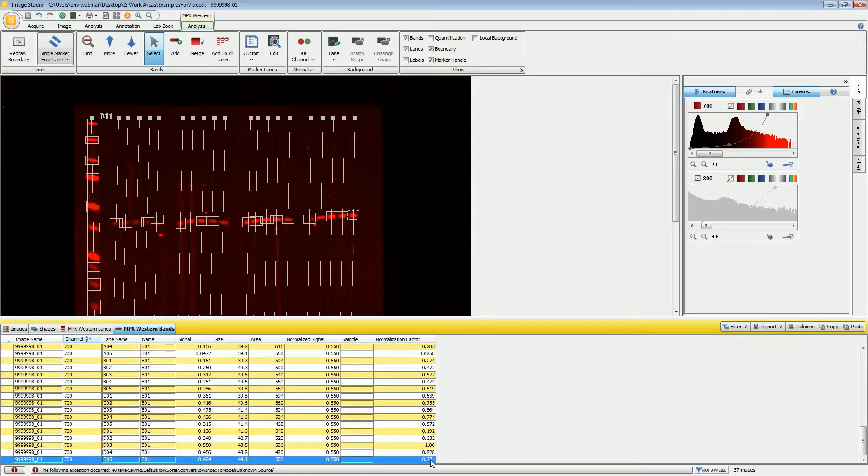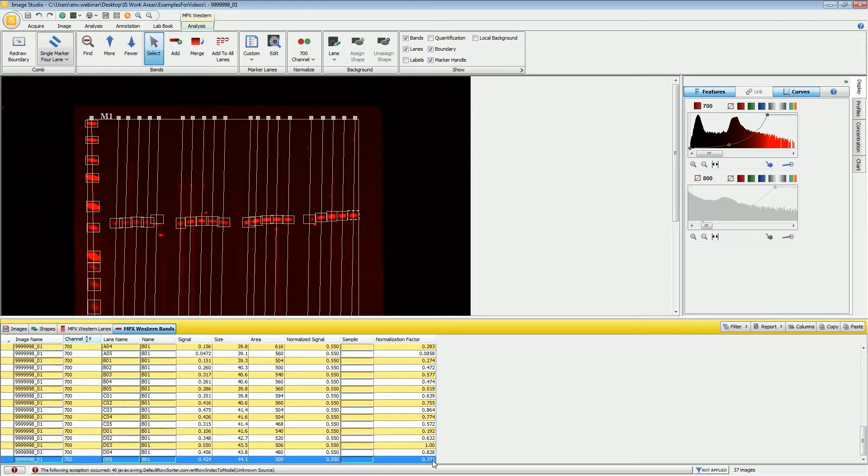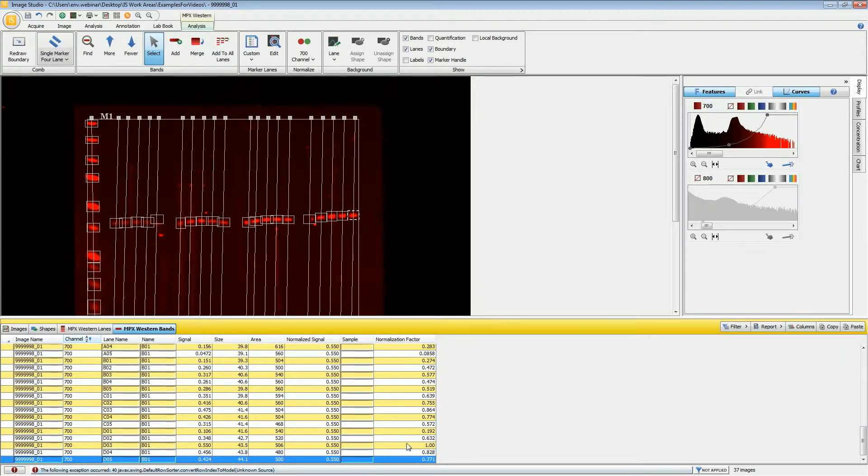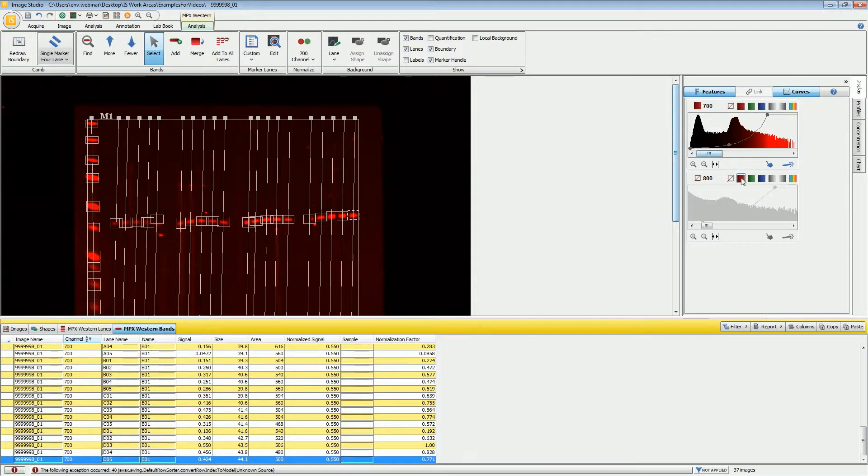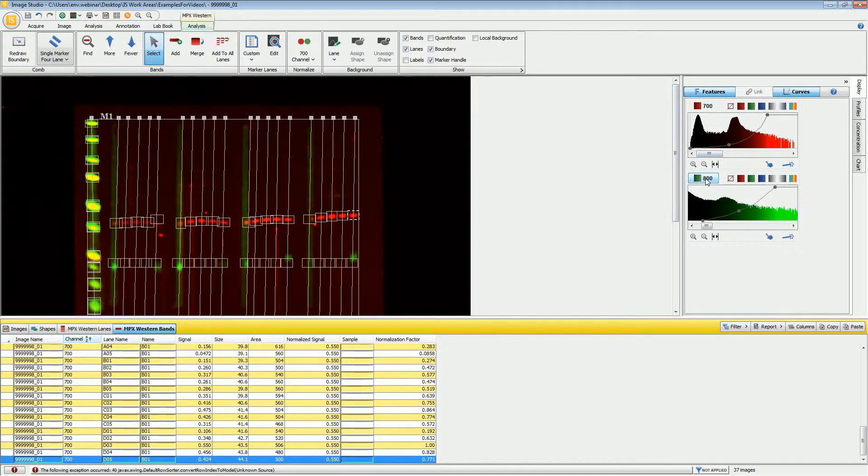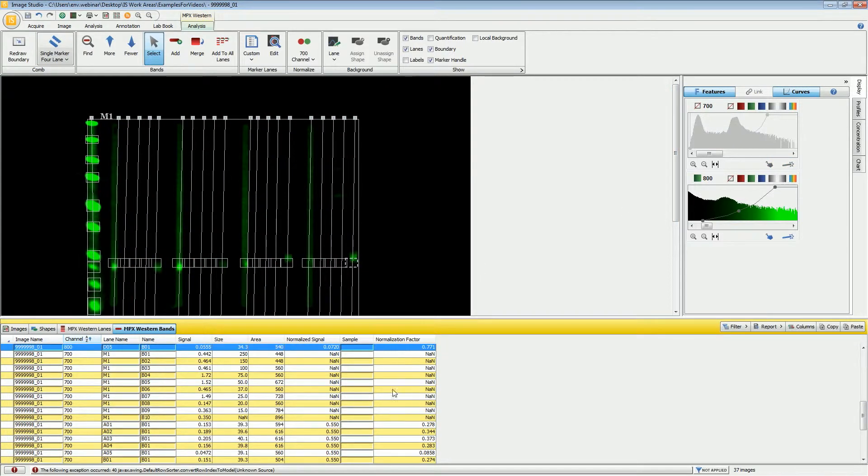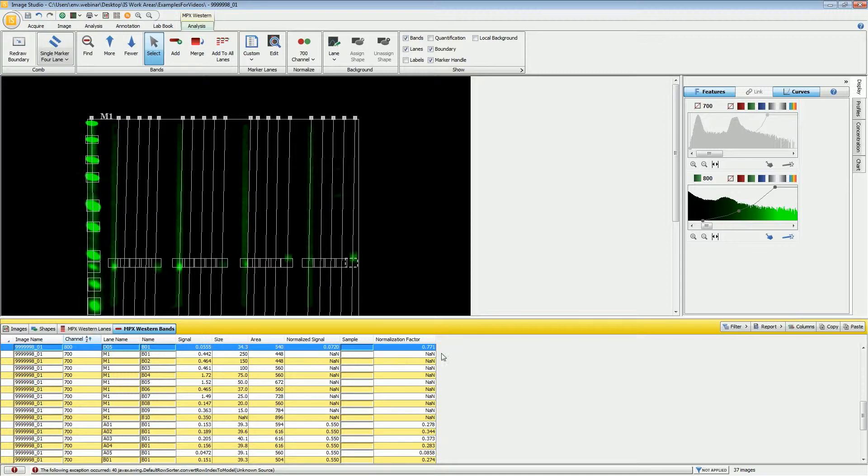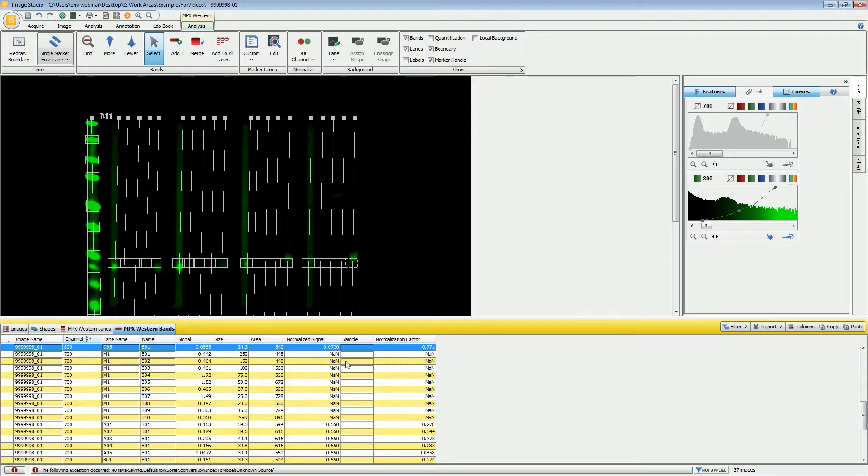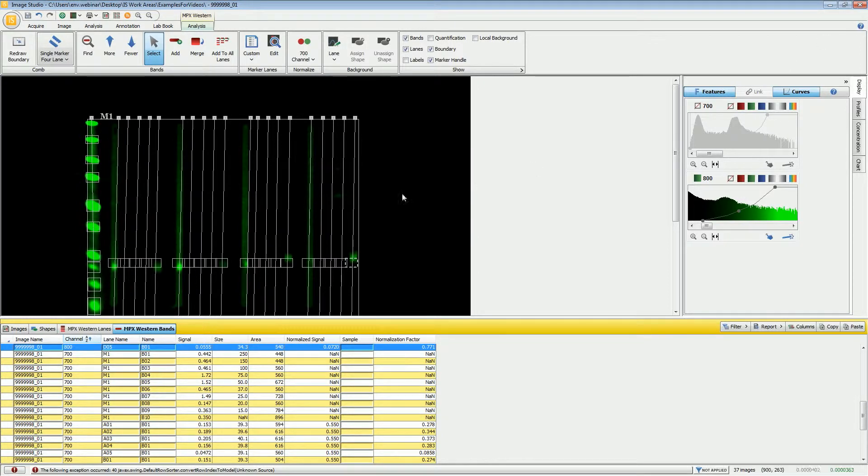This 0.771 means that image studio has determined that there's 77% as much protein loaded in this last lane as compared to the reference lane. It then takes that normalization factor and applies it to the signal from the 800 channel. Using the same lane, this 0.771, it takes the signal divided by the normalization factor to come up with the normalized signal. That's the process that it goes through. If you would like to see some more information on how that calculation is done, if you click on the help button, there is more information about the full calculation.